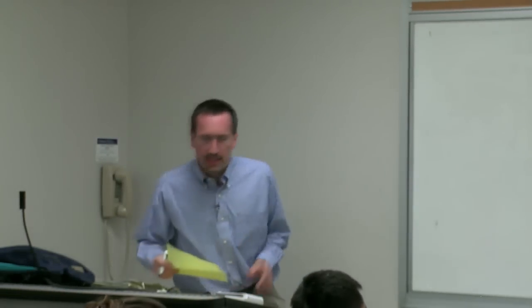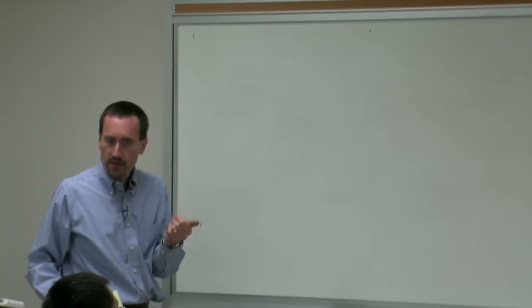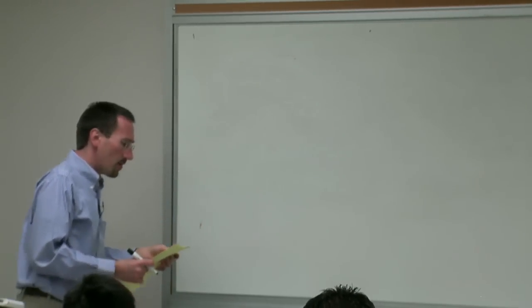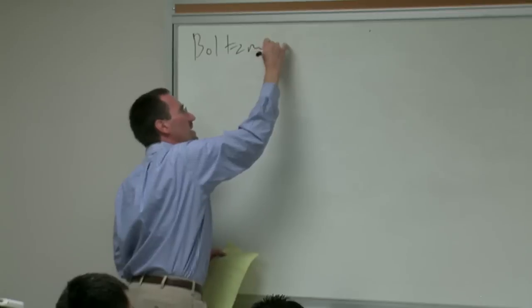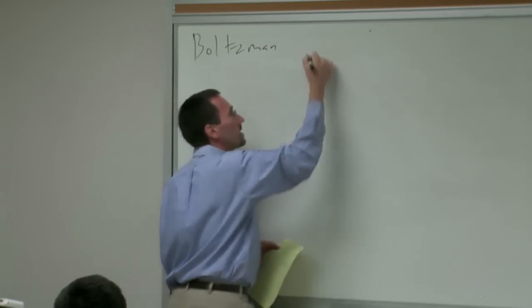All right, the last thing I want to talk about: I've talked about how damned we are by energy being low. I've talked in the case of carbon about isotopic abundance. But now the really damning thing ends up being the Boltzmann distribution. That is the population of the spin states.